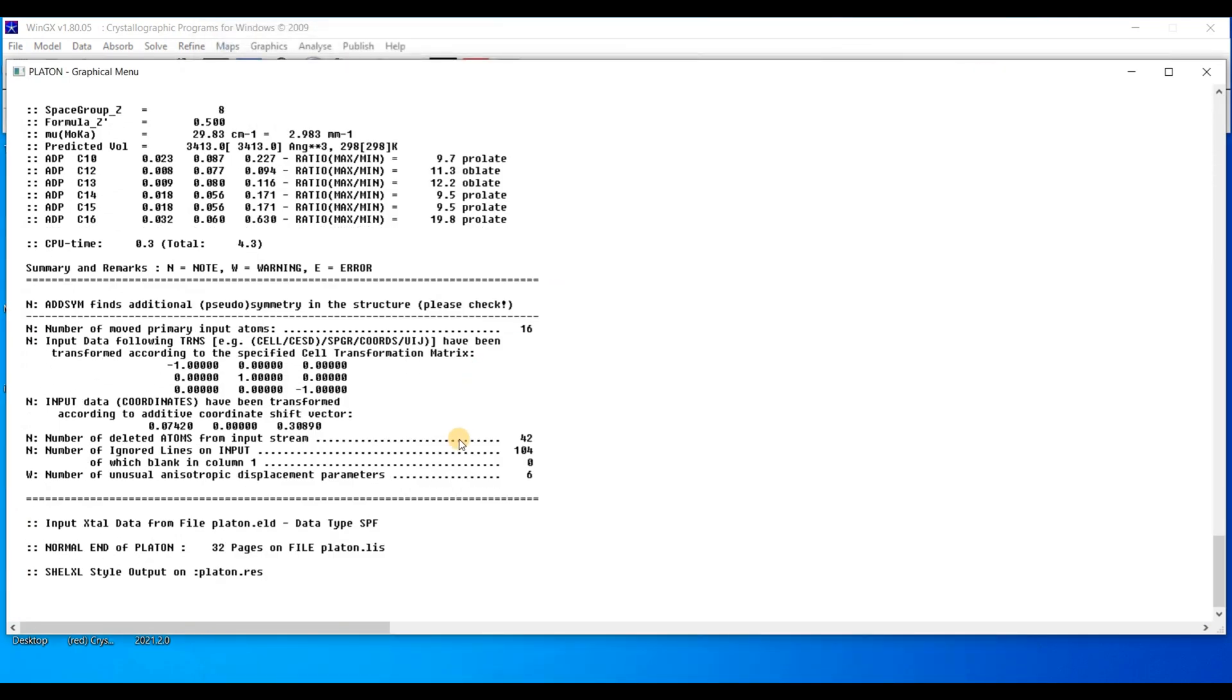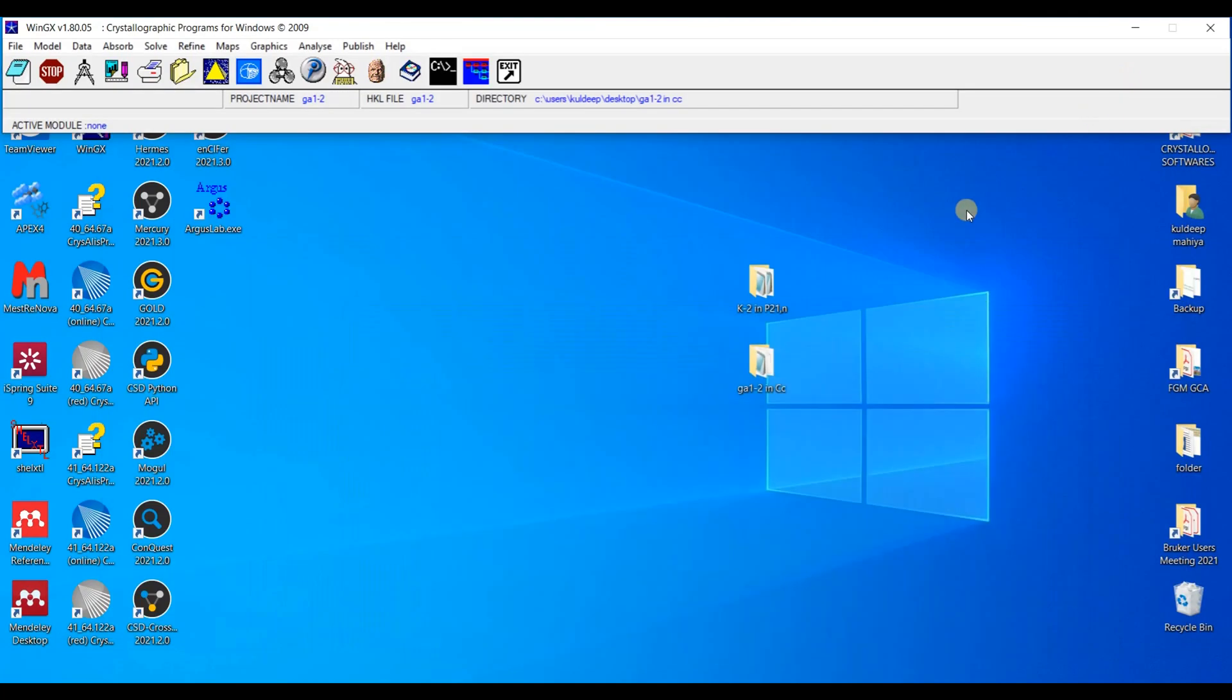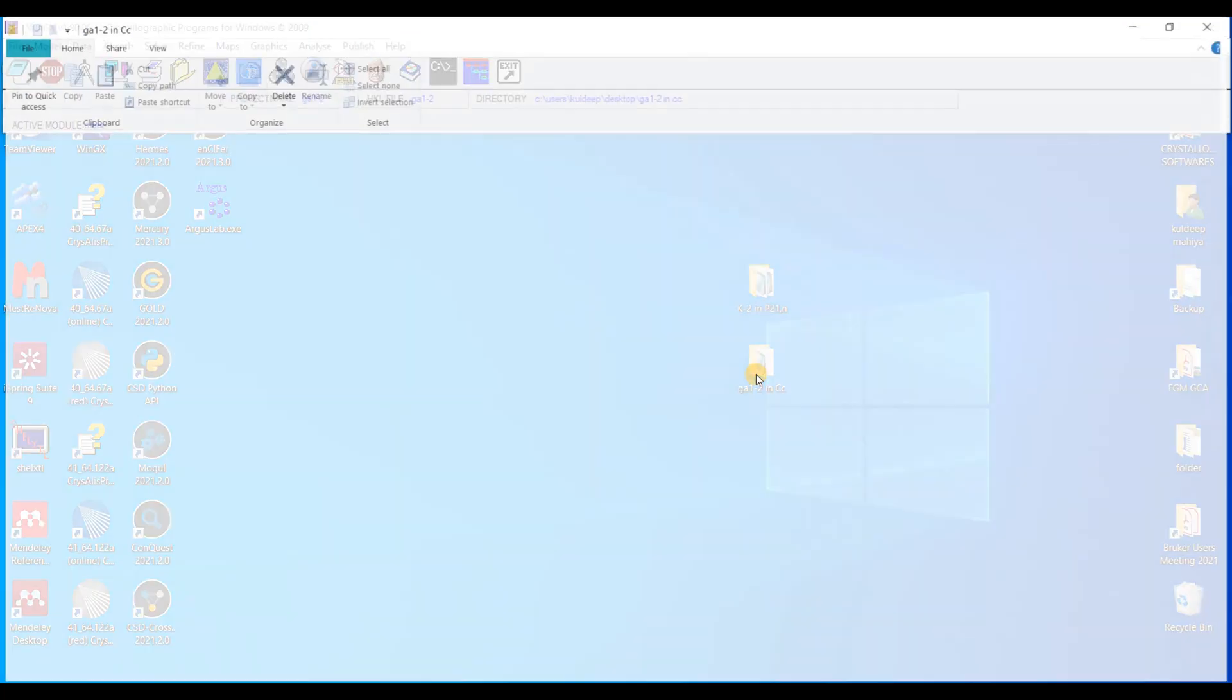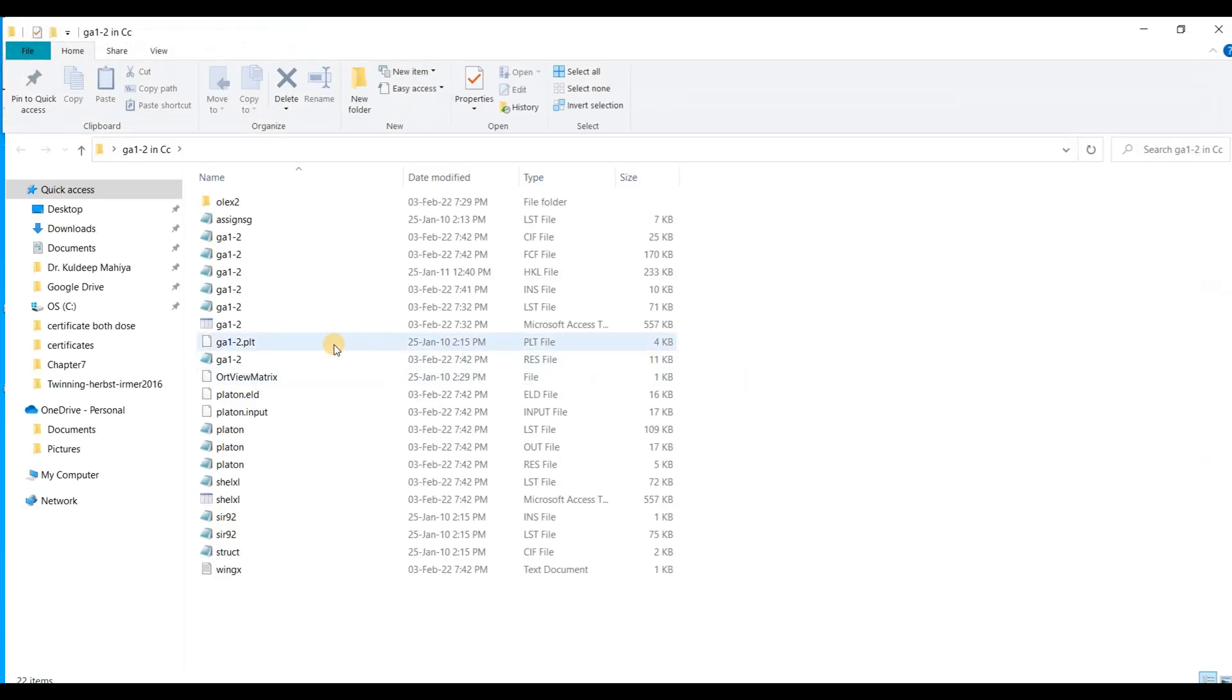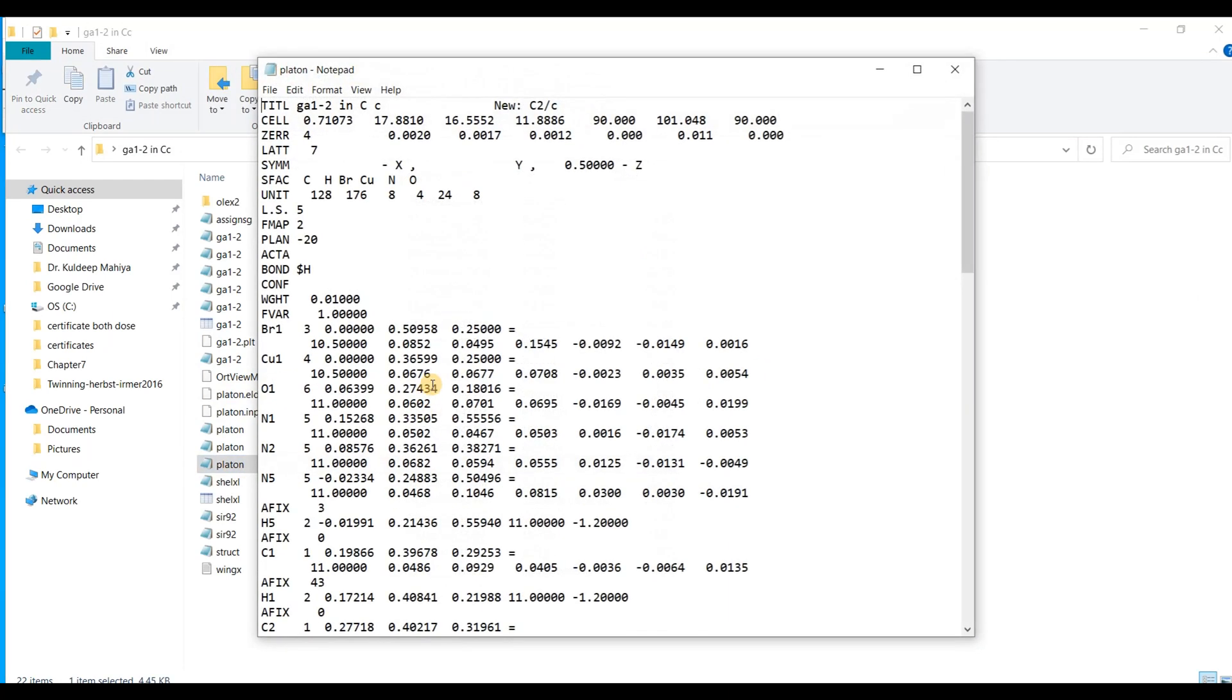And it will do some calculation in the background and a new file named platon.res is generated in the same folder. Okay, I am going to the folder. And here I have the file platon.res. Double click it. And a new space group C2/c is here and this CC is old one.